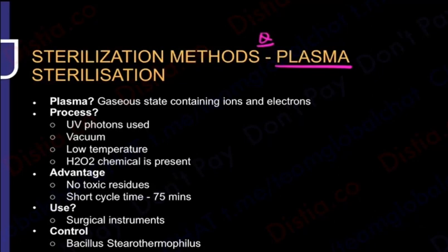Then we used to say that there is a 4th state of matter, plasma, and that is nothing but ions and electrons. Do you remember? You used to study in physics, chemistry in your school. 4th state of matter is plasma. So you'll say, ma'am, now I've understood why this is important, because you're doing such experimental things. You are creating 4th state of matter. How should I create 4th state of matter?